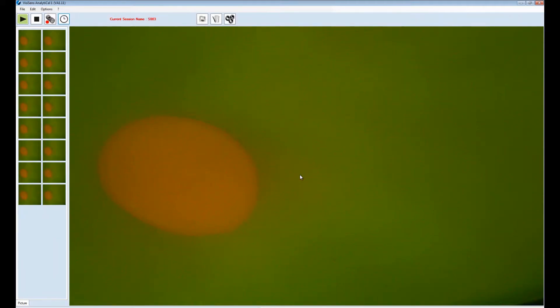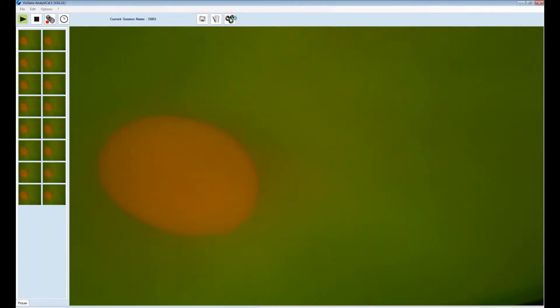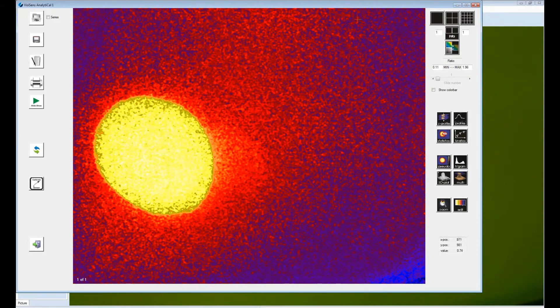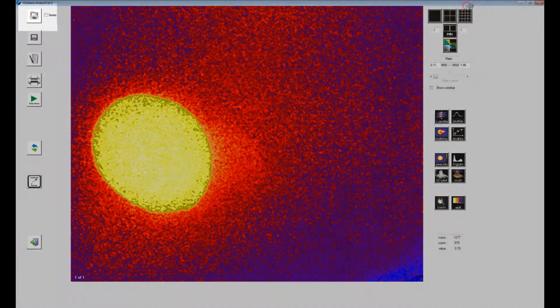This is a short introduction on basic evaluation functions in the VisiSens AnalytiCal 1 software. Go to the button bar and click the evaluation button. The evaluation module opens and a pseudocolor image of the last recording is displayed.